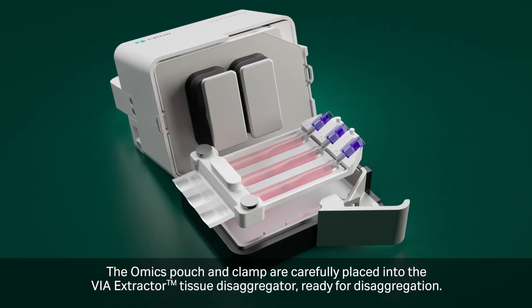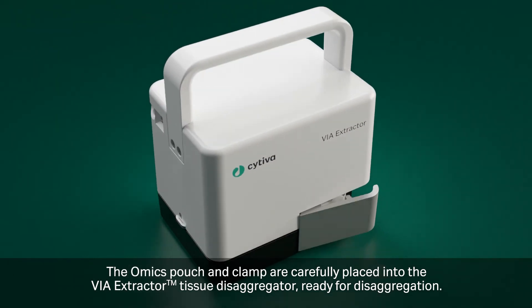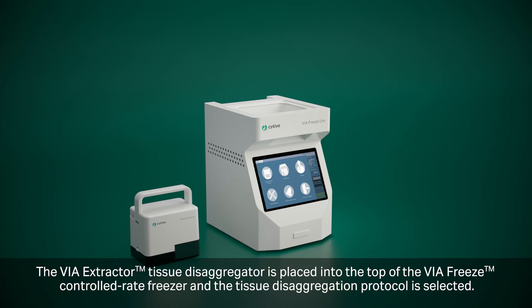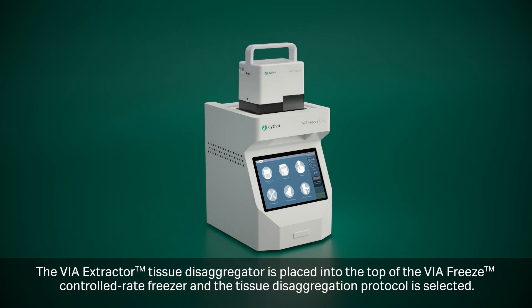The Omics pouch and clamp are carefully placed into the VIA Extractor, ready for disaggregation. The VIA Extractor is placed into the top of the VIA Freeze and the tissue disaggregation protocol is selected.